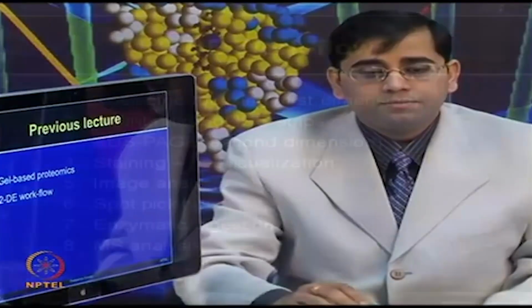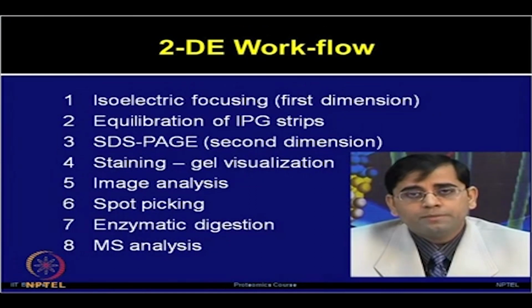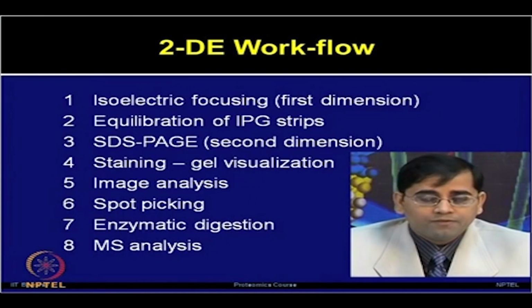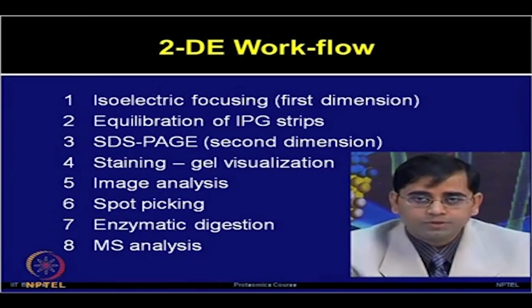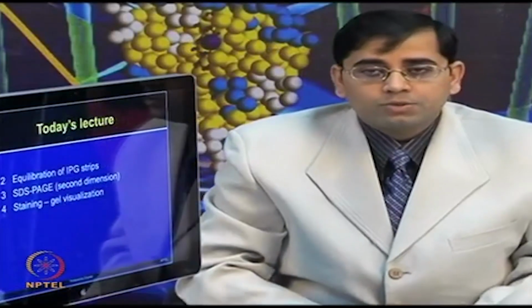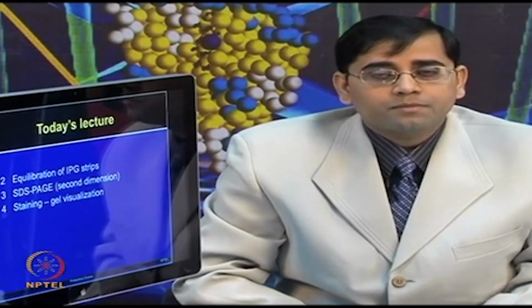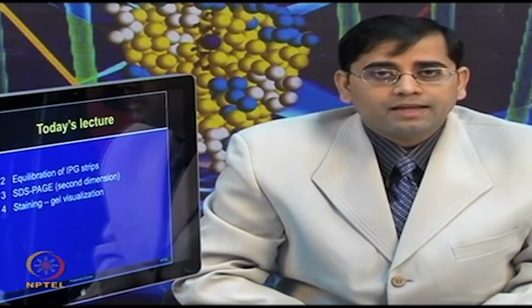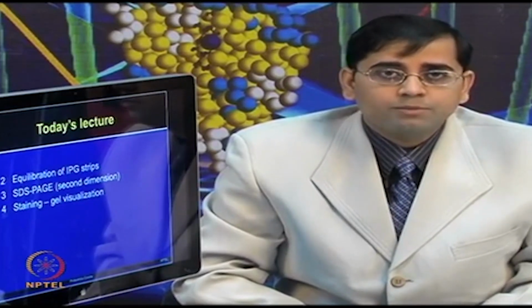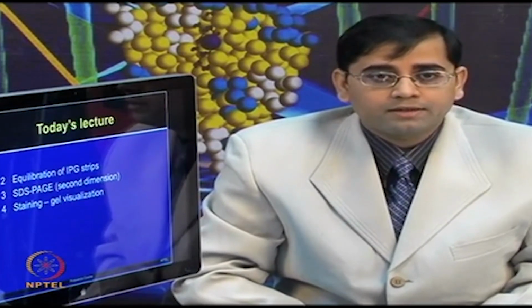In today's lecture, we will talk about the workflow of two-dimensional electrophoresis. The first step was already described in the last lecture, and then we will discuss a few more steps today. We will focus on the equilibration step, how to equilibrate the IPG strip, and how to perform SDS-PAGE, which is protein separation in the second dimension based on molecular weight.